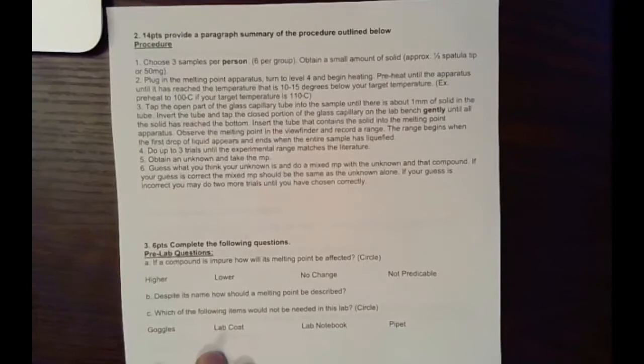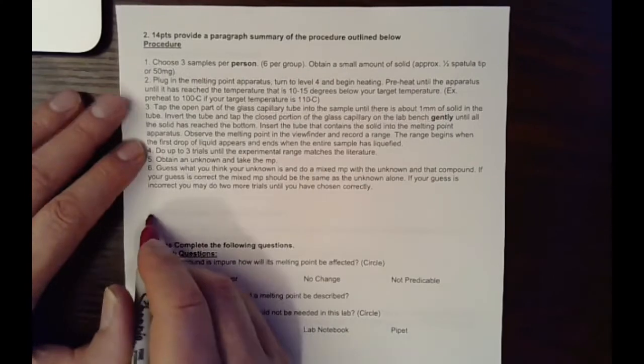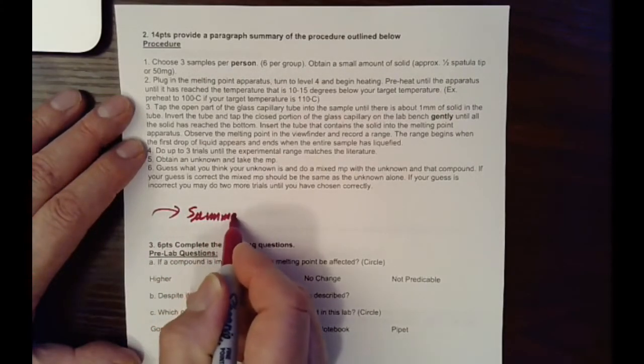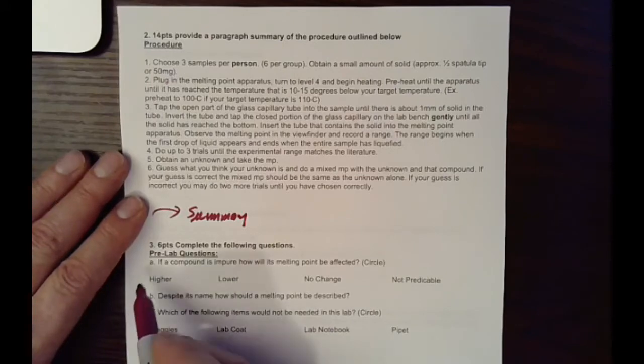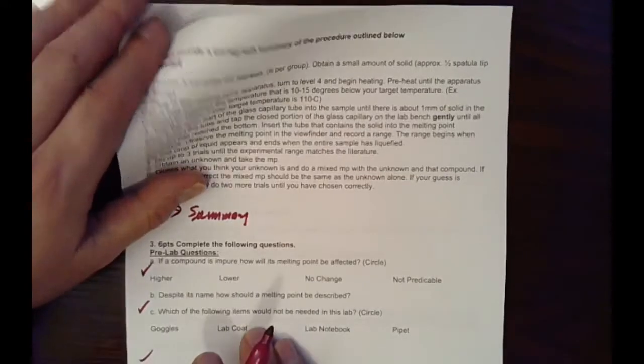Fill the page 2. So page 2 usually is a procedure we read before coming to the lab. Make a little summary here. So what we did, and look at that YouTube. That YouTube is very good. Answer some of the pre-lab questions. Fill it out.